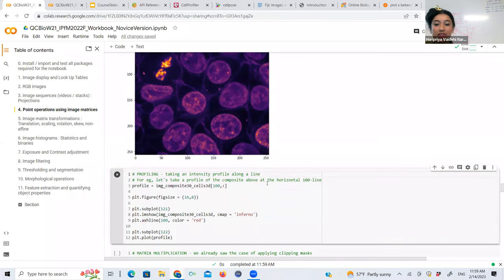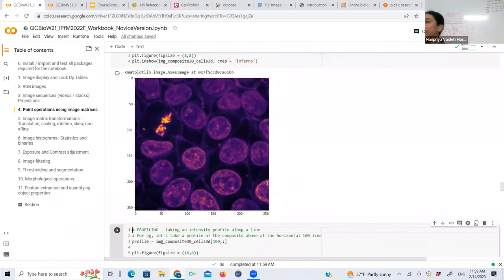That's it. One of the important things that you need to do when you add is make sure that you're not going above your range. If you have 8-bit images from 0 to 255, if your maximum pixel values are 255 and 255, you add them both together, you're not going to get 510 because your range is just 0 to 255. You're going to get 255. So that's not real adding. In that case, what you want to do is halve the first image, halve the second image, and add them together. So 255 by 2 plus 255 by 2 gives you 255. So when you add images, just be very careful about the range. Don't go over range, otherwise you'll just saturate out pixels. Same for RGB? Same for RGB, yeah.